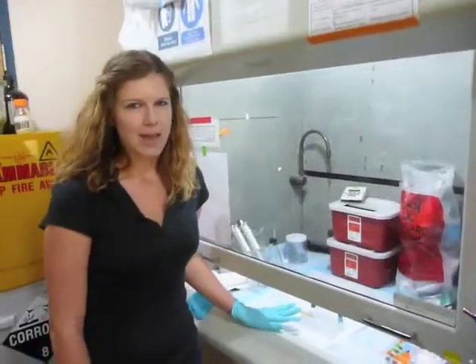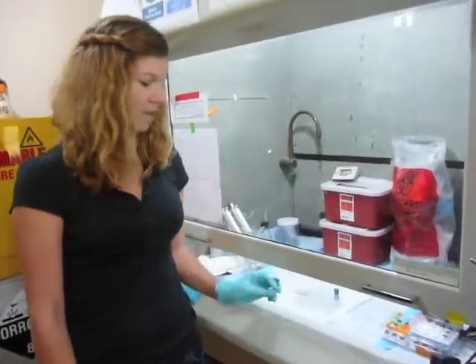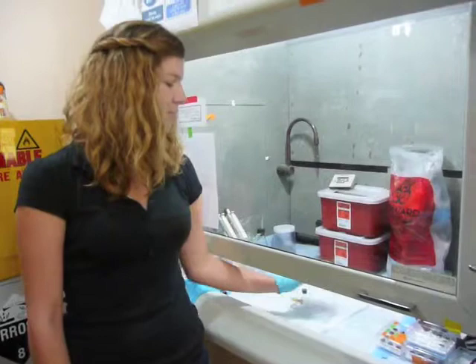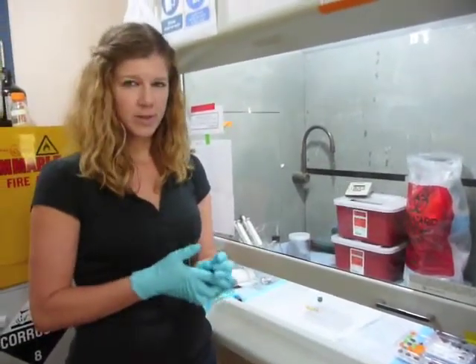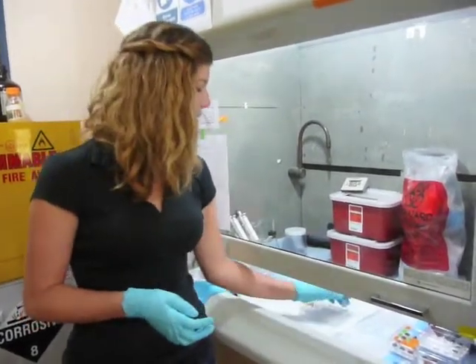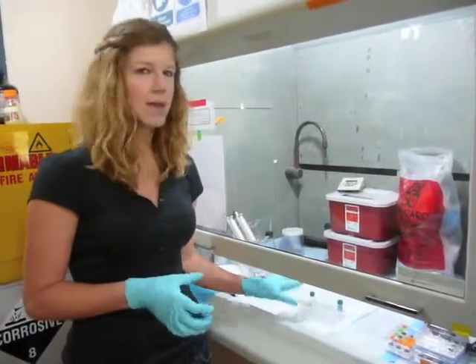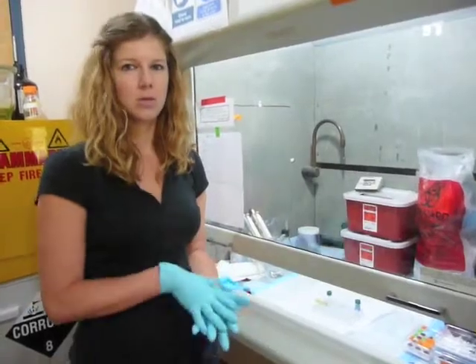After your larvae are relaxed, you can start the fixation process. I put the larvae in a vial and I'm going to add a couple drops of 5% glutaraldehyde to the vial. The amount of drops varies depending on the size of your larvae — I'm going to add just about three or four drops. In about five minutes they should all settle to the bottom, and that's how you know you can proceed.